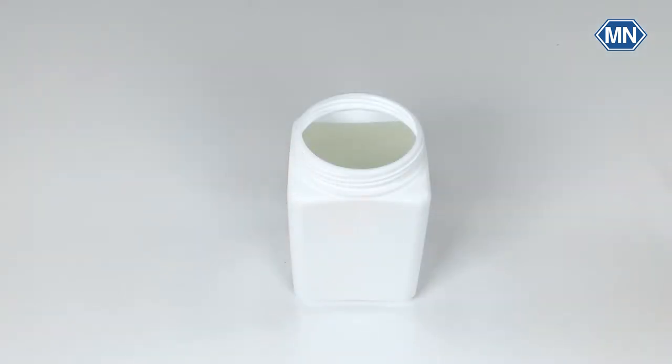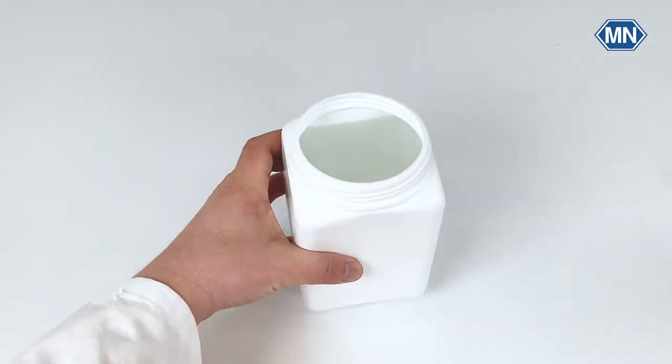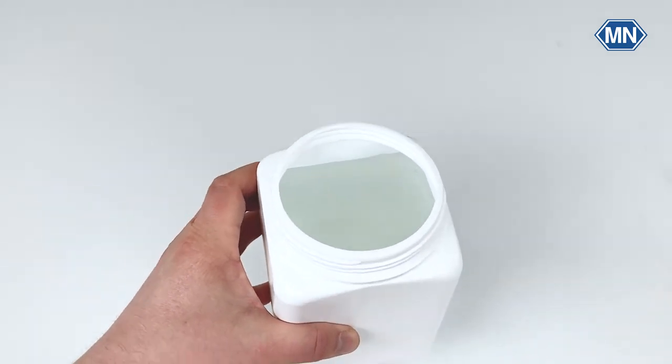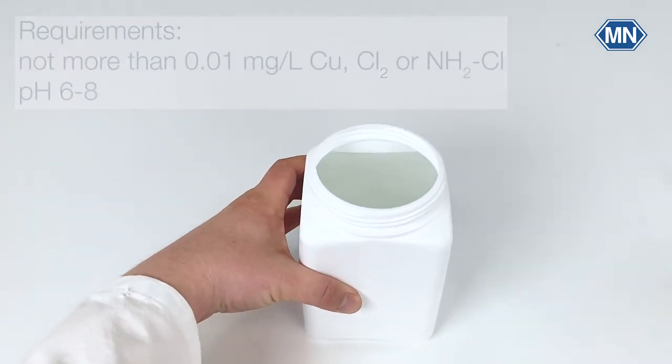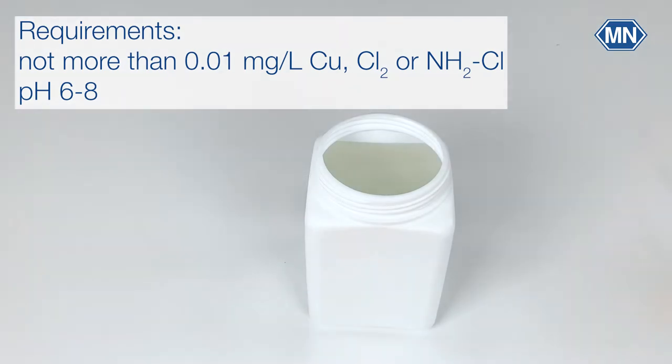Fill the storage vessel with water. For this you need unchlorinated tap water. The water must not contain more than 0.01 mg per liter copper, chlorine or chloramine. The pH value should be between 6 and 8. If necessary adjust the pH with sulfuric acid or sodium hydroxide solution.